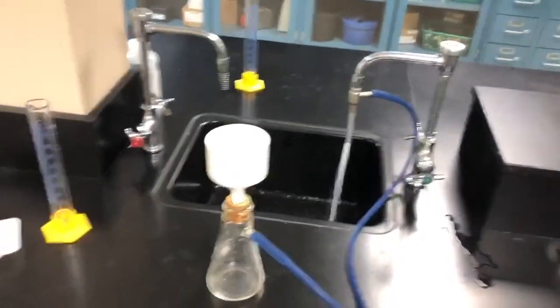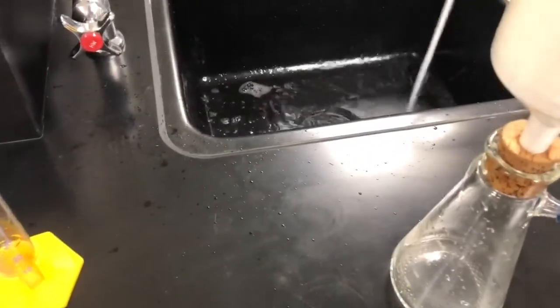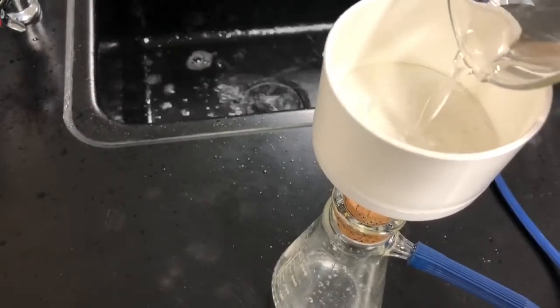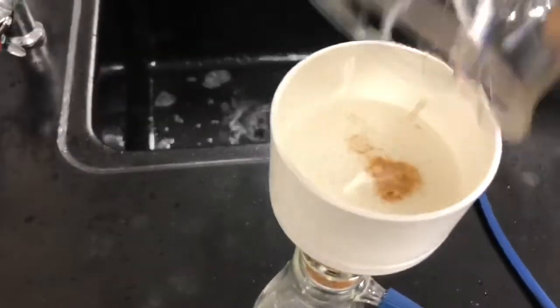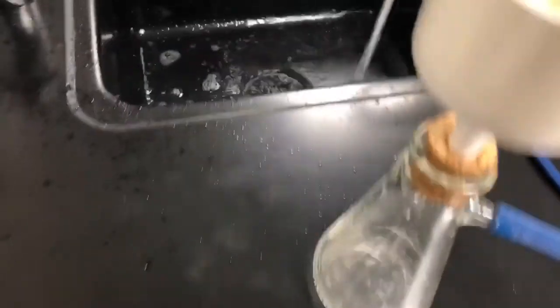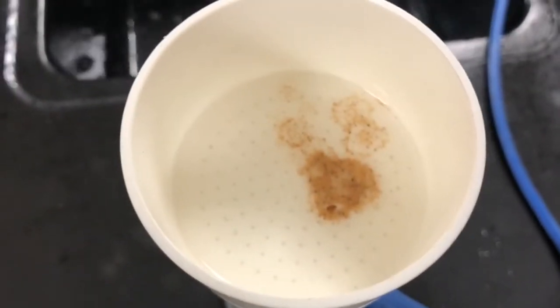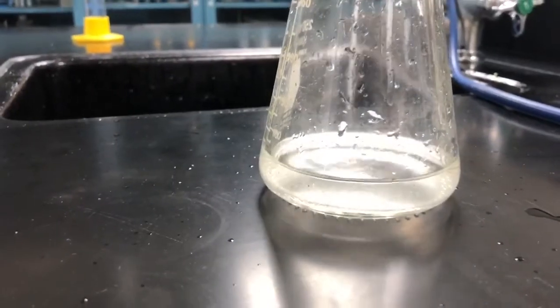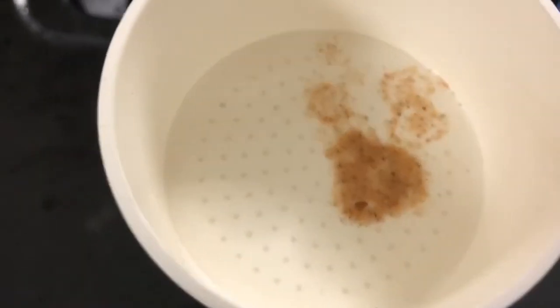There's the sand in the water. Pour it inside the funnel. A little gravity combined with the vacuum is sucking the water out, leaving just the residue - the sand on the filter paper. The filtrate collects in the flask below. Pretty much all the water is gone and you're just left with the sand on the filter paper.